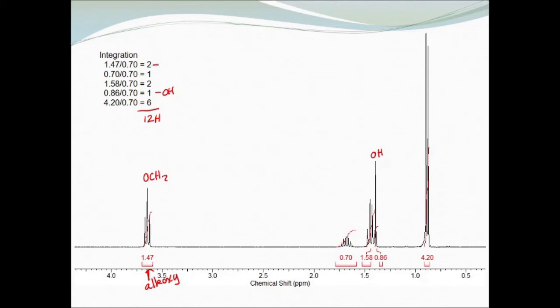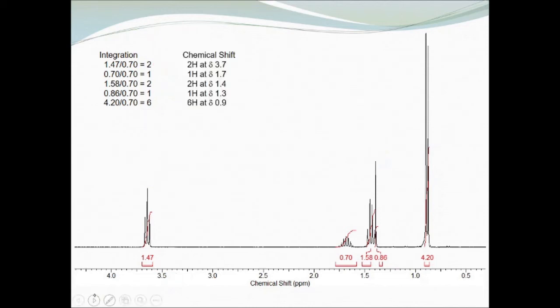And so this is OCH2. And all of the rest of the peaks are within that 0.7 to 1.8 range where we find alkyl CH. So we have these pieces here, and from the shifts we have then those particular groups. We have our alkoxy identified, we have the OH, and the others are all alkyl groups.